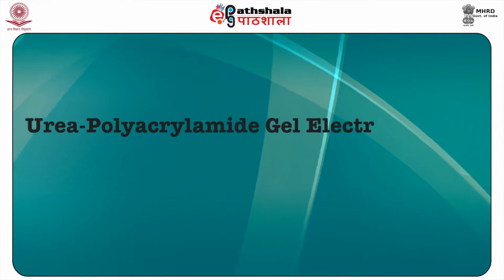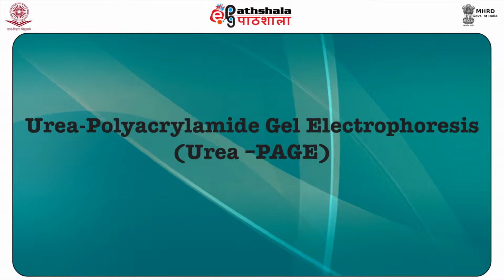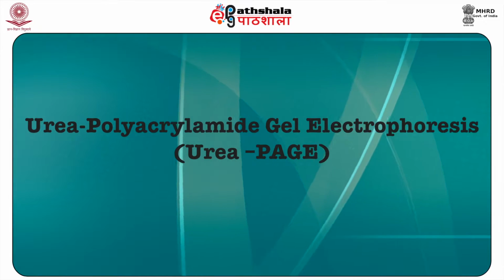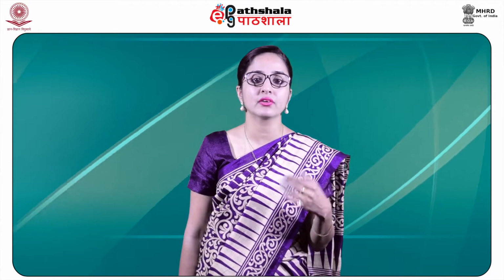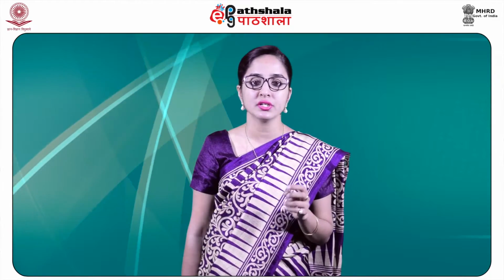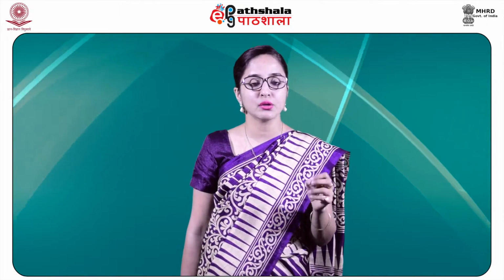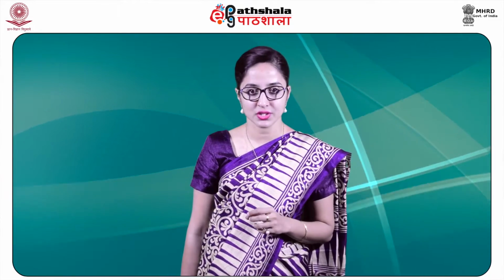Let us now discuss urea polyacrylamide gel electrophoresis, also shortened as urea PAGE. Denaturing polyacrylamide gels are used to allow the separation of molecules by their relative size by keeping the molecules denatured. Formamide and urea are often used to denature the DNA and RNA, and they allow their separation on the basis of size by keeping the molecules single-stranded. Samples can also be heat treated for denaturation.